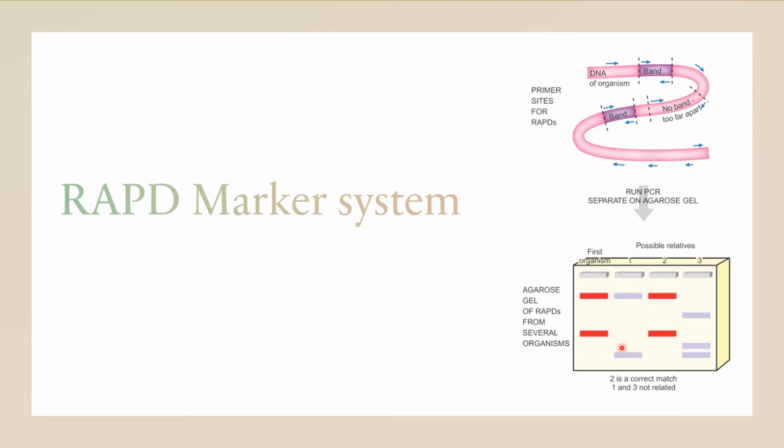All right. So if the backgrounds are all the same, they're supposed to produce the same type of banding marker. So maksudnya, when it has a band here, it's supposed to have a band here also. If it has a band here, then it's supposed to have a band here. So the banding pattern here and here is supposed to be the same.